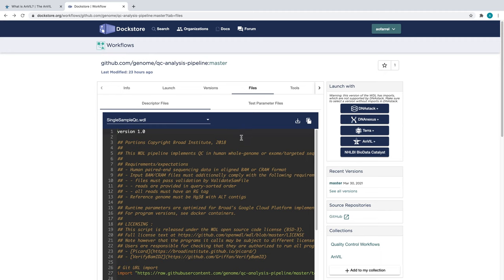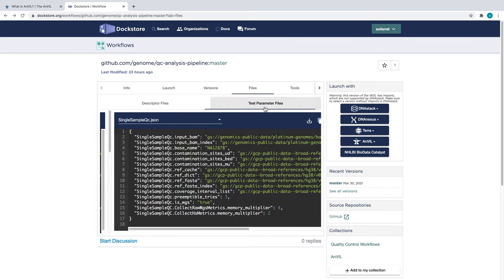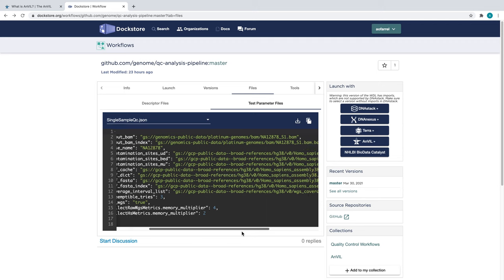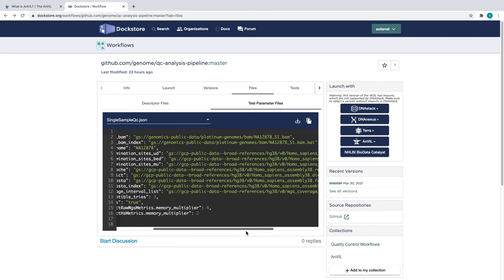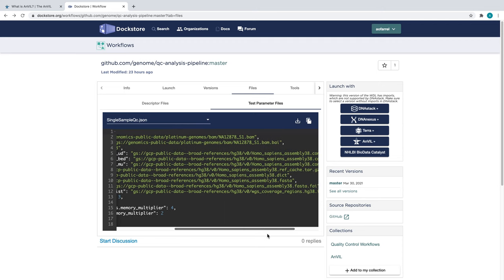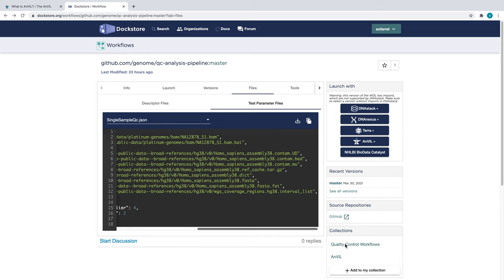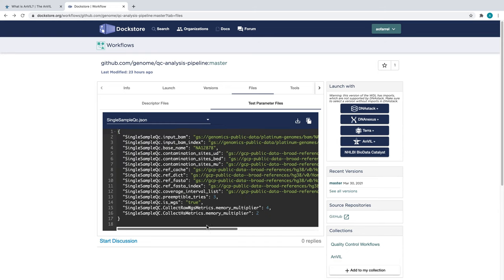If we click on the Test Parameter Files tab within this Files section, we are taken to a JSON file. When working with WDLs, you generally use a JSON file to specify the inputs and settings for a workflow. For instance, the first line of this JSON specifies a particular BAM file located at a particular Google Cloud Storage link. You will need a Google Cloud account and billing project to access most Google Cloud files. In DocStore, the JSON files specify example inputs for workflows. This means you can use it as a template or even a complete test case without having to set up a configuration file yourself.